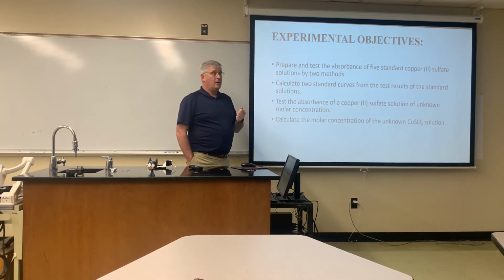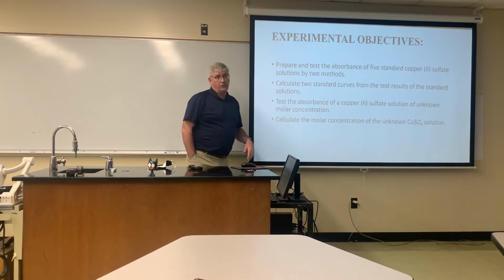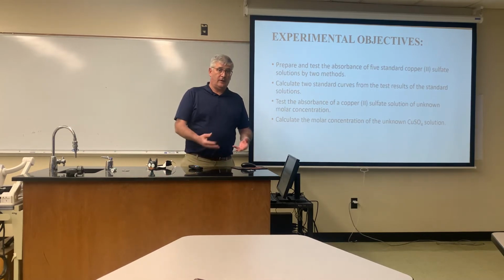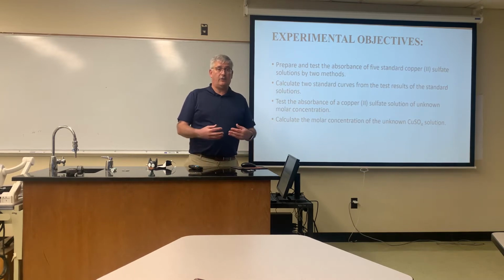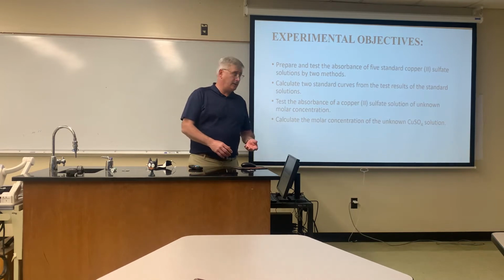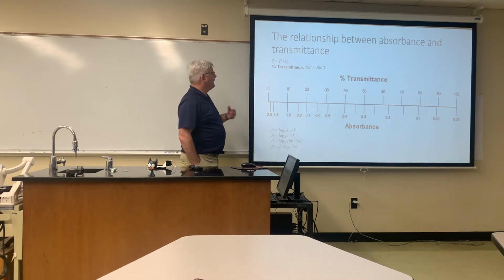We'll do the analysis on both of those, and we'll end up with 2 different standard curves. Then we're going to take an unknown. We have prepared a solution whose concentration will be unknown to you, and you're going to analyze it for the concentration and use your calibration curve to find that. It's the same process that we're going to be doing for the semester-long project with the phosphate ion. So I want you to practice making standard curves and analyzing those to help you work on your ability to measure.